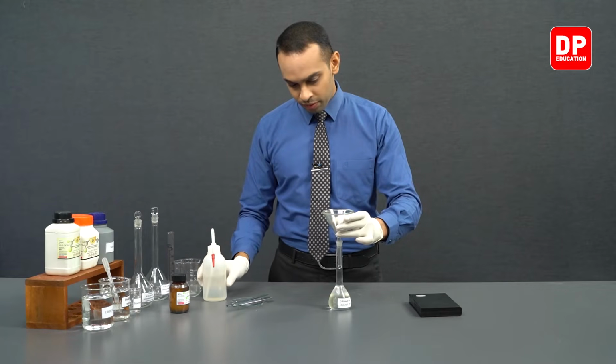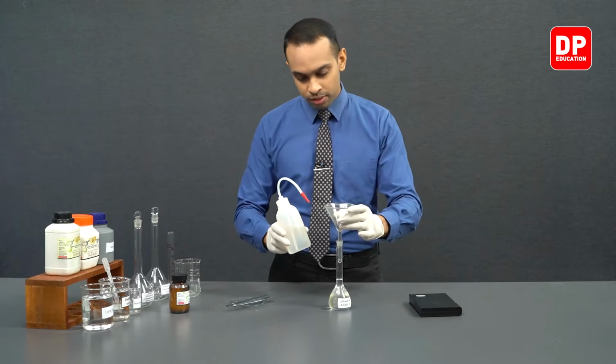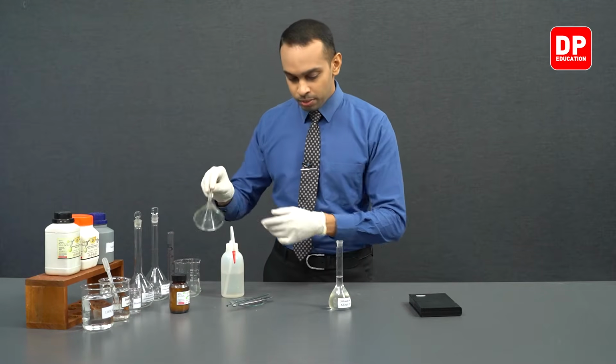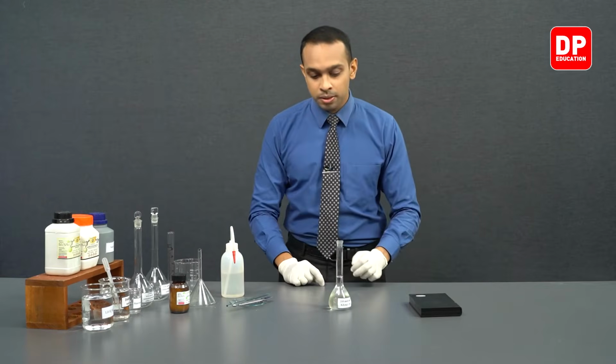Afterwards, students, we can very carefully wash the internal walls of the funnel as well.